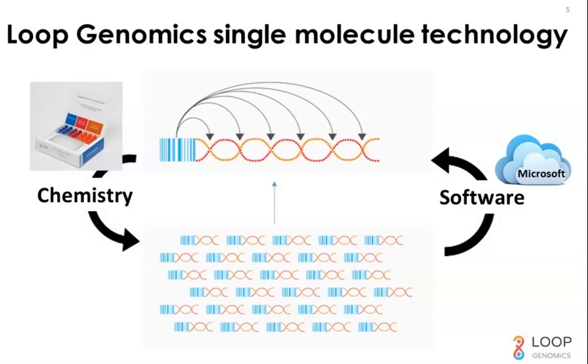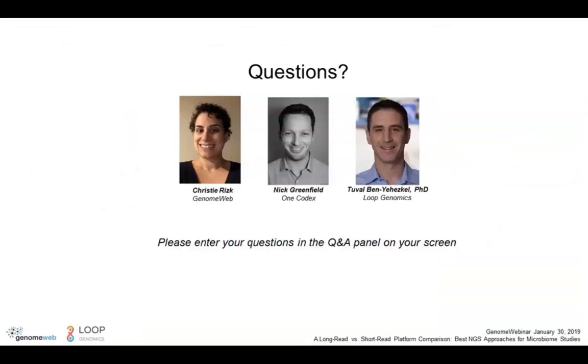But I think fundamentally the way to think about this is if you look at short read V3, V4 sequencing data, and you look at each read independently, it's a really hard problem to get rid of the false positives, right? That's because those errors look like real variants, or there is a sufficient amount of error that you mismap to the wrong reference. So at the individual read level, there's not much to do, and we're kind of in the territory of aligner design in thinking about that.